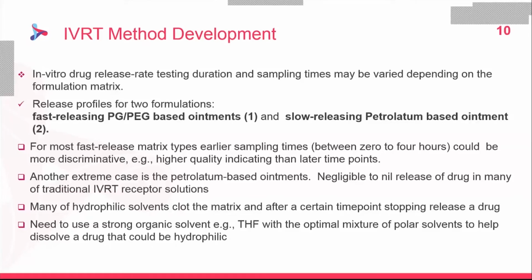So due to fast solubility, the formulation matrix migrates through the membrane into the receptor medium and rapidly releases the drug. There is a slim chance you will find such a solvent or mixture of solvents that immerse the membrane and matrix but accept predominantly the API. That is the famous equation based on the ointment film: no swelling, no ointment matrix dissolution.